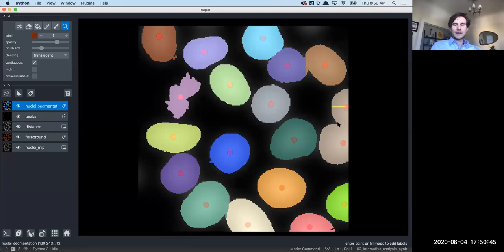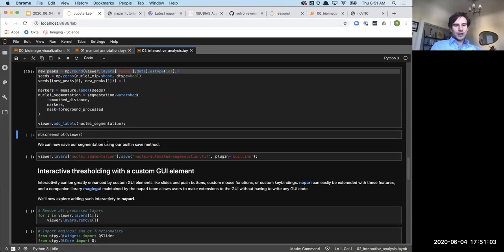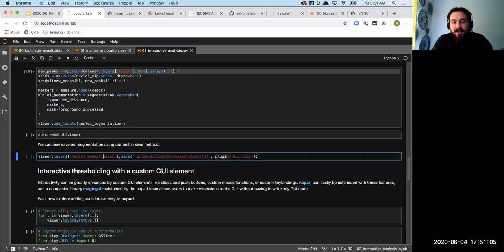Maybe a little bit of funkiness going on there. Maybe, you know, something that can be edited there. But I can actually take the paintbrush now and manually correct that if I wanted. And so there you can have a workflow where you did an automated segmentation on thousands of your cells, but then you did a quick manual touch up as well. So that's an example.